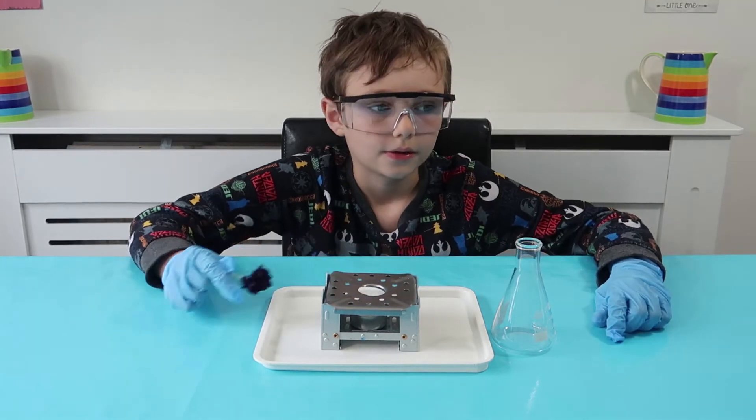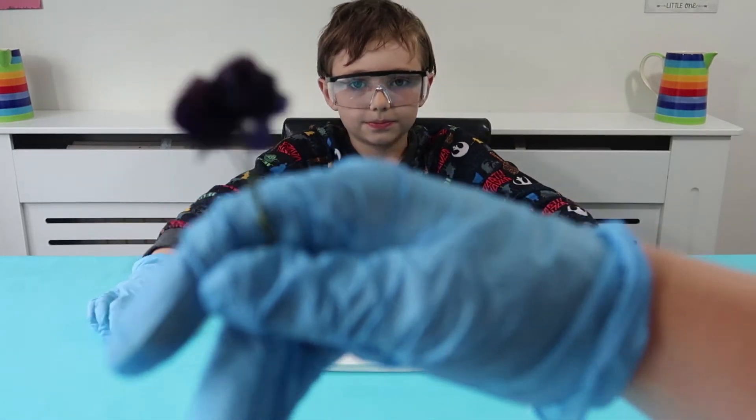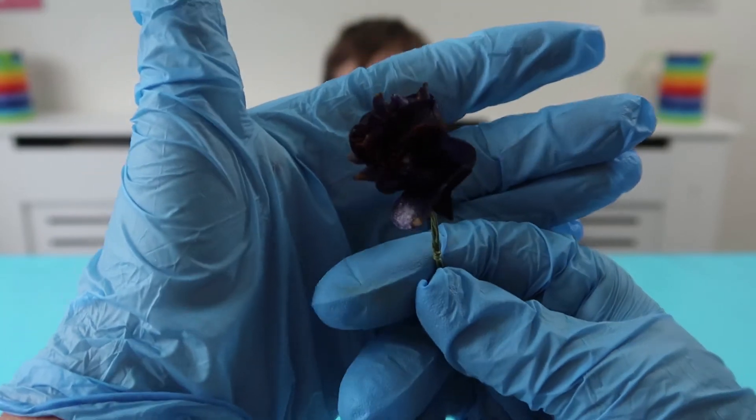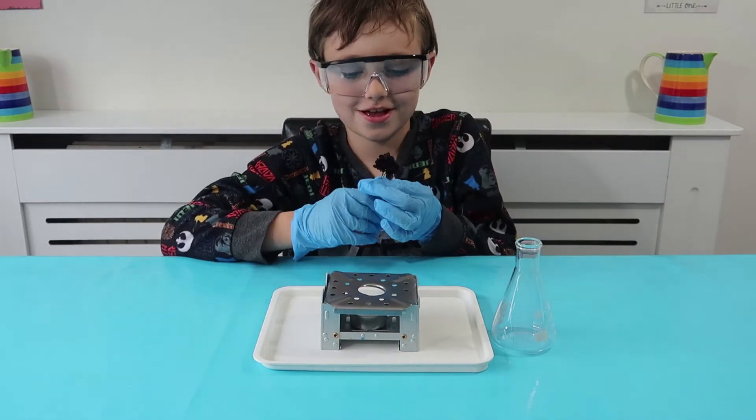We've got this nice blue flower now. Let me show the boys and girls what it looks like — there's our nice blue flower. Okay, here you go — I got you a blue flower!